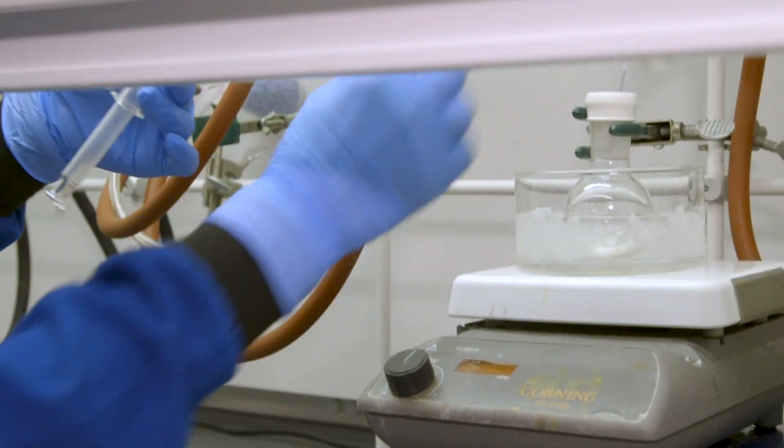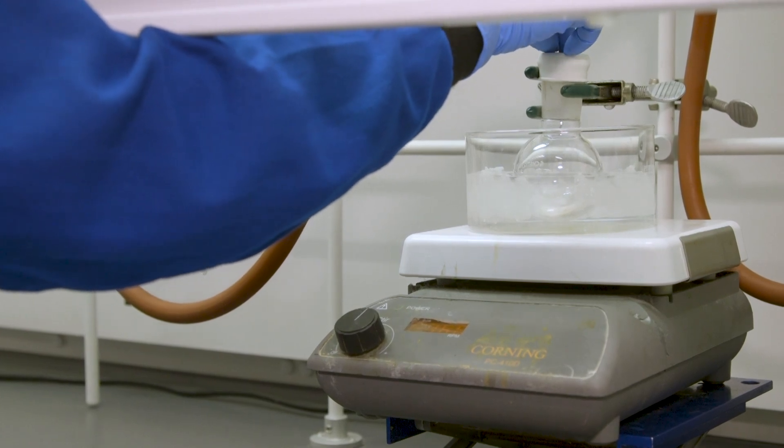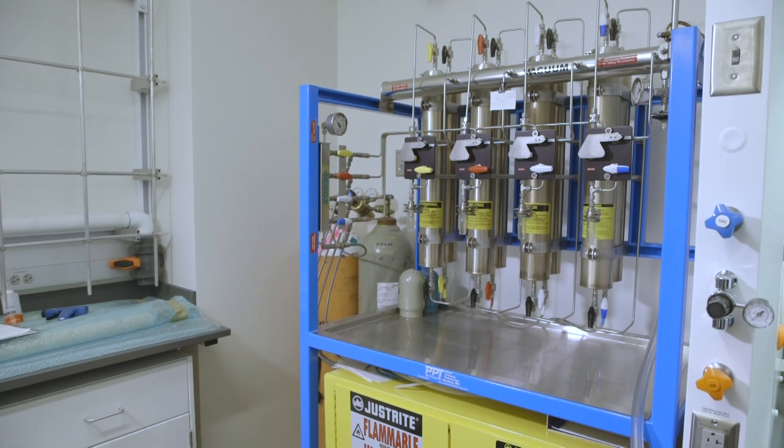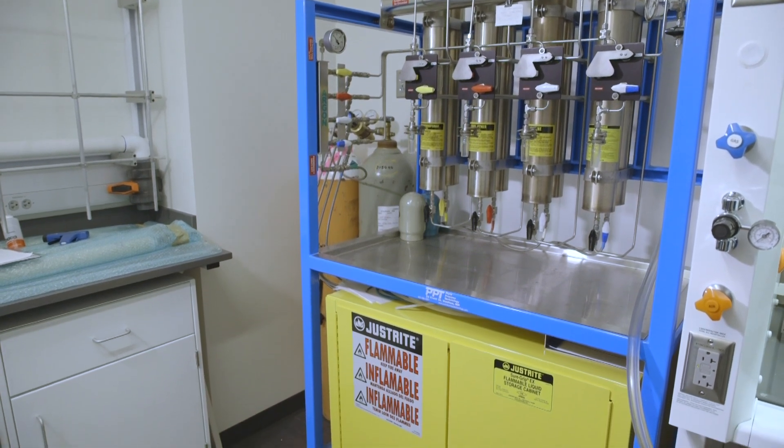These valves break easily and can shatter glassware if over tightened, but allow the valve to be opened much more slowly. Solvents should be purified, meaning air and moisture free. Solvent purification is beyond the scope of this course. A solvent purification system is the safest way and best practice to prepare solvents for use.